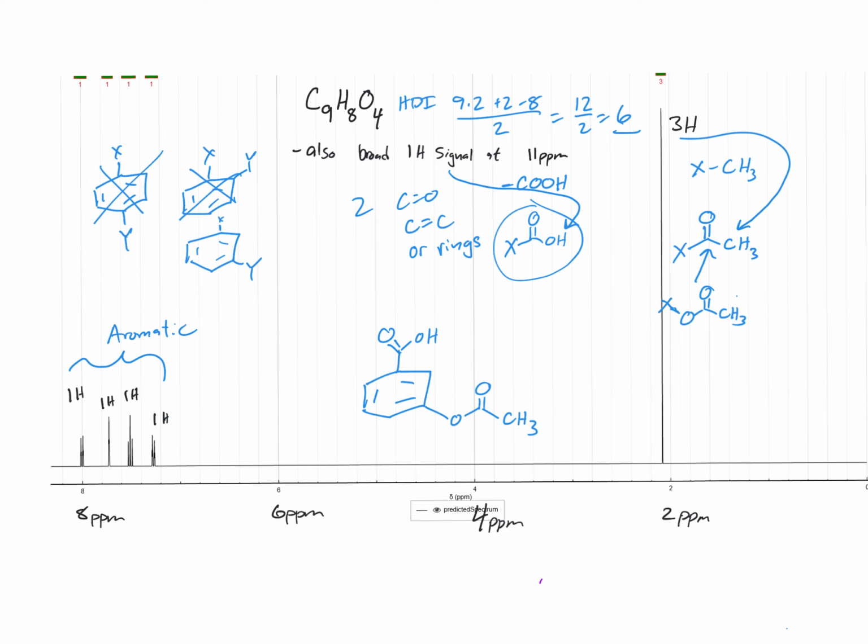It should fit, I'm sorry, a complete molecule. It should fit the formula, 6 carbons, 7, 8, 9. I've got 4 hydrogens, 5, 6, 7, 8, and I have my 4 oxygens. So I believe that this is the best structure solution for this data.